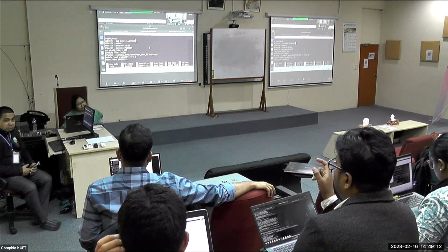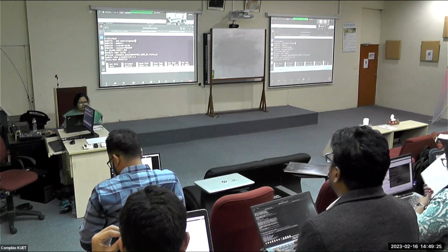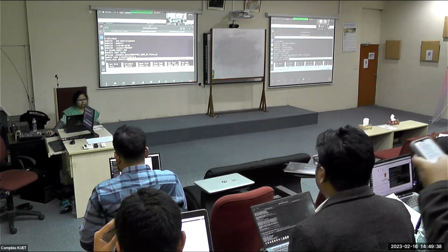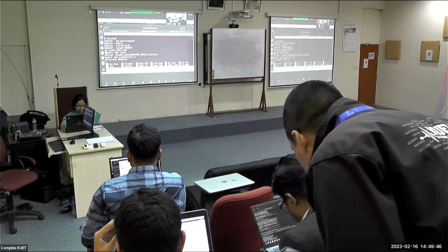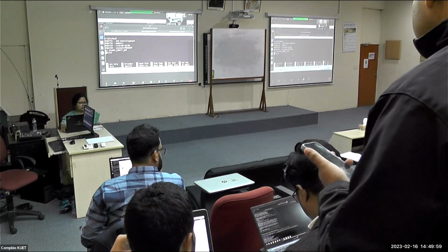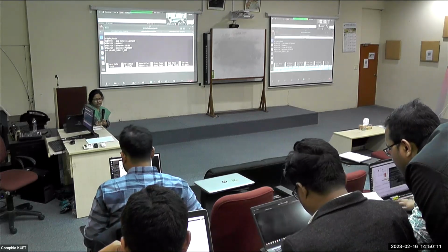Nano space, then the file name. Any file name you can create and copy this. You all have this format already. It's in the Slack, I saw. And what I will change from here, you will not need these portions. Whatever command I use, I can just remove those. So this is the basic structure you need to have in the file. You can keep that file in the main home directory or in the mapping directory as you want to have it. I mean, if you want to organize it in the mapping, then you can have it there.